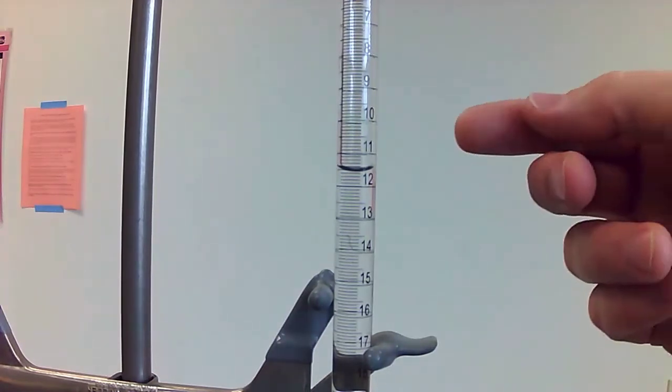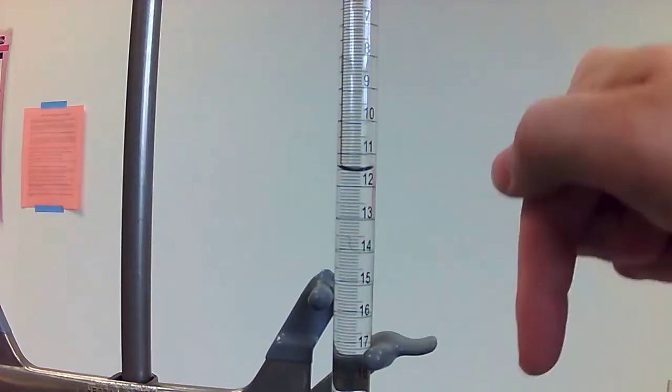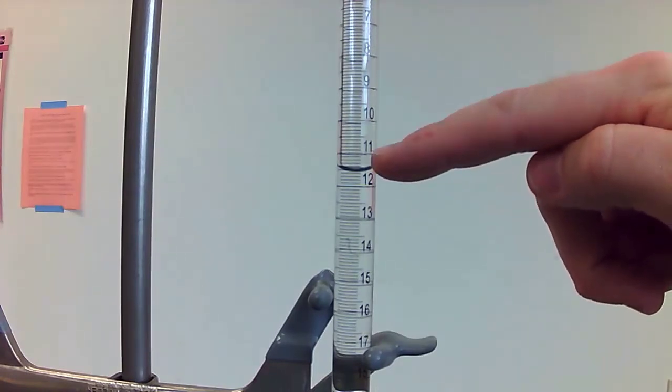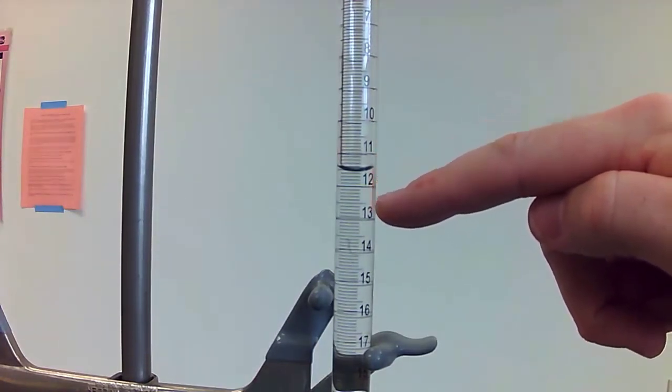And then now the other thing you have to keep in mind is that the scale is upside down compared to graduated cylinders and other things you're used to using. So the 11 is on top and the 12 is below. So you have to keep that in mind that it's 11, 11.1, 11.2, 11.3 as you go down.